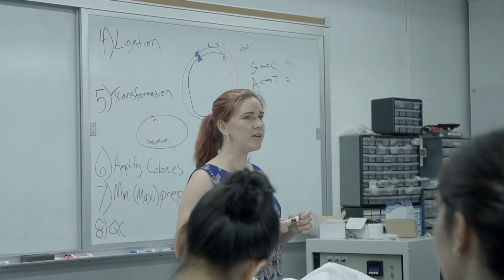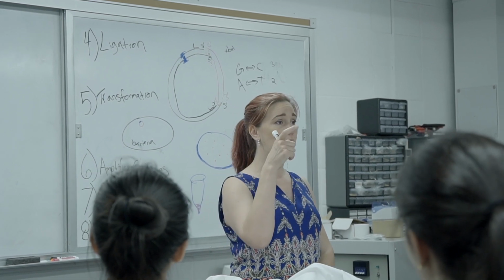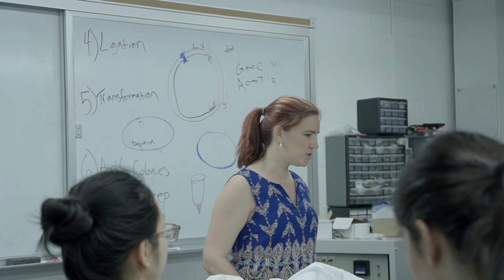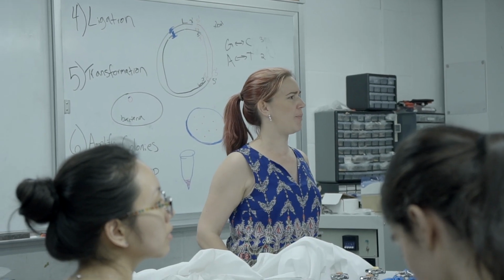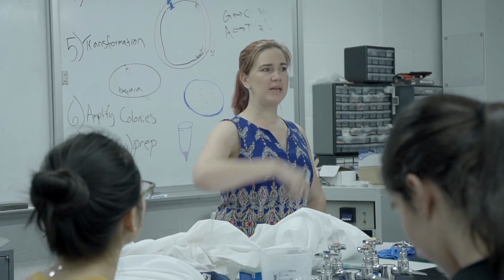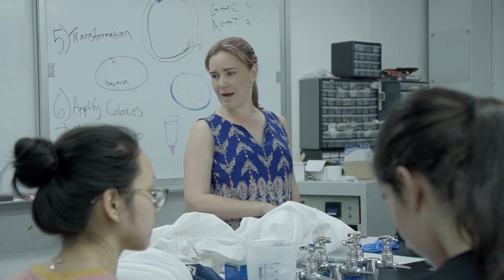All right. So what we're going to do, and we'll have to do this in groups, is look at our DNA. If you want to get your phones out, you can take a picture, and then we'll finish up by, I think, do they all have a ladder picture in their packet? Do we have a picture? We just have a couple. I emailed it to the script. It wasn't in the protocol. Okay, I think we've got a couple that we can set on the table, and we'll figure out what size our different bands are, and if it was right. Then we'll do a little pub trivia like we did last time, with our original groups from this morning, and then we'll call it.